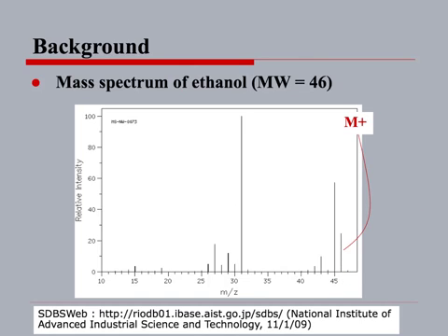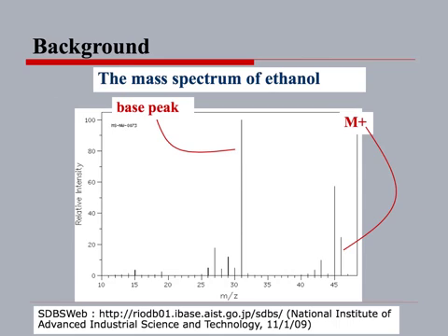You can think of it this way: I am running a solution I got from somebody, and they say, I don't know what is in this mixture. Can you detect it? I run it through mass spec, and I get a peak of 46. I can say this is ethanol. So somebody brings you an ethanol bottle without a label on it, you can run it through mass spec. If these peaks are present, you can quite definitely say it is ethanol. So it's an important detection technique.